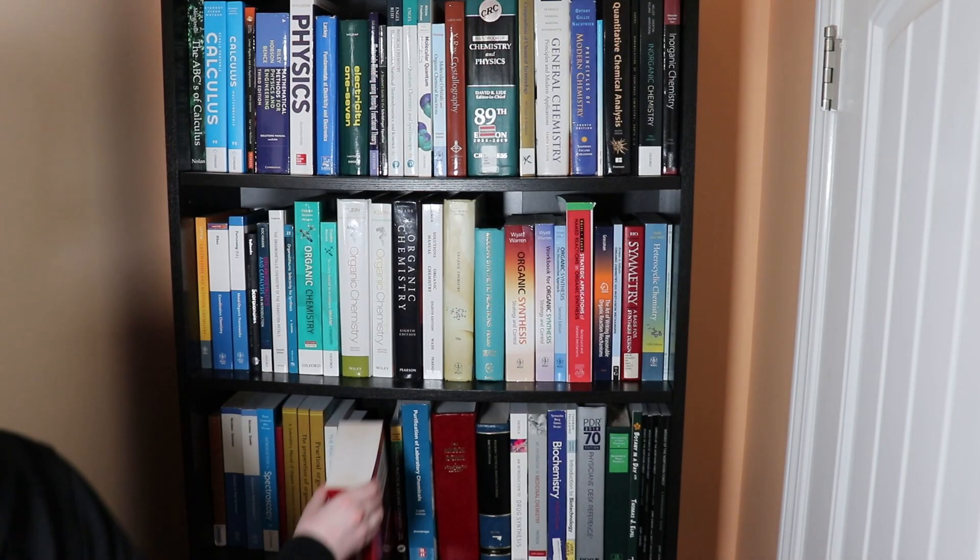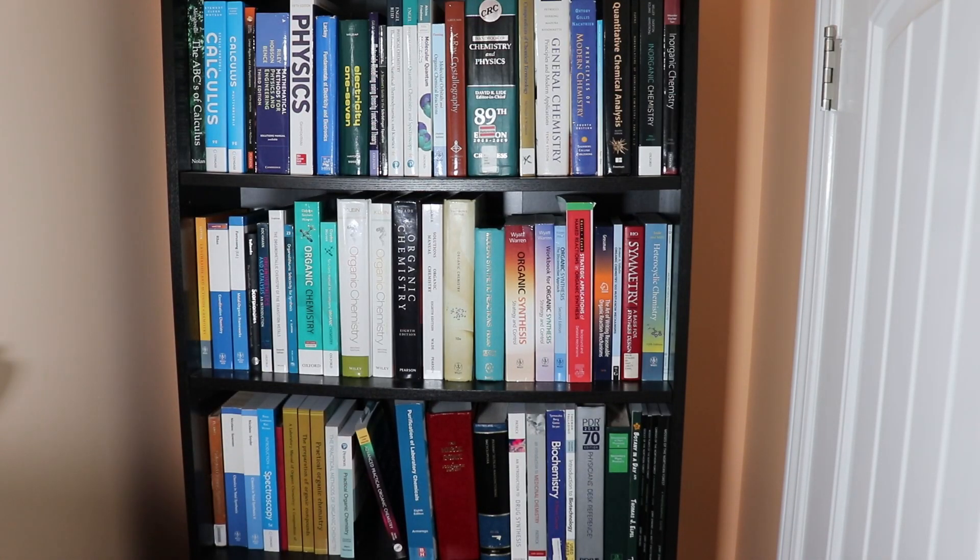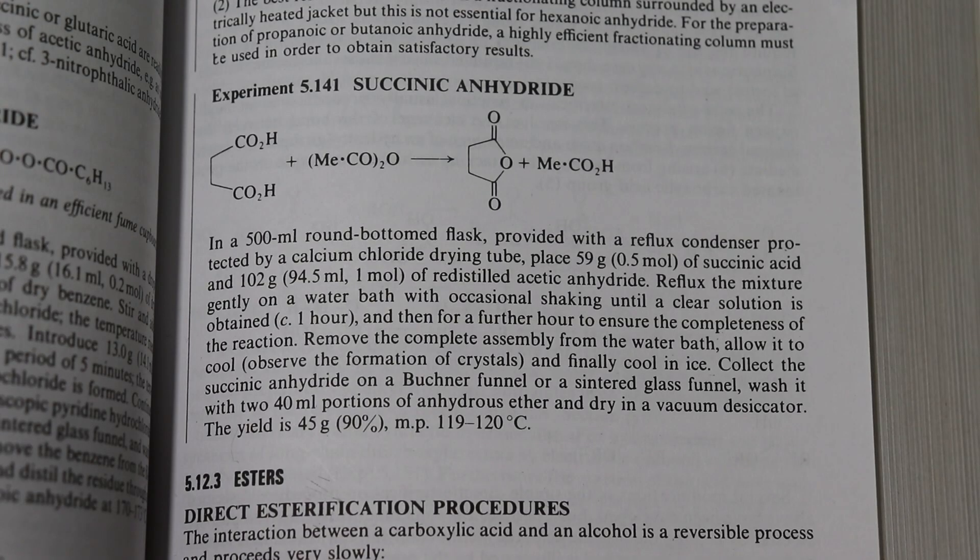In this video, I will demonstrate the preparation of succinic anhydride from succinic acid and acetic anhydride following the procedure in Vogel's Practical Organic Chemistry.